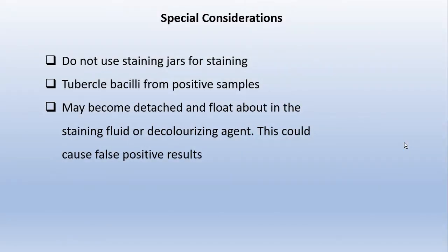There are special considerations you want to follow when staining with this stain. Do not use staining jars for the purpose, because tubercular bacilli from positive samples can be detached and float in the staining jars.